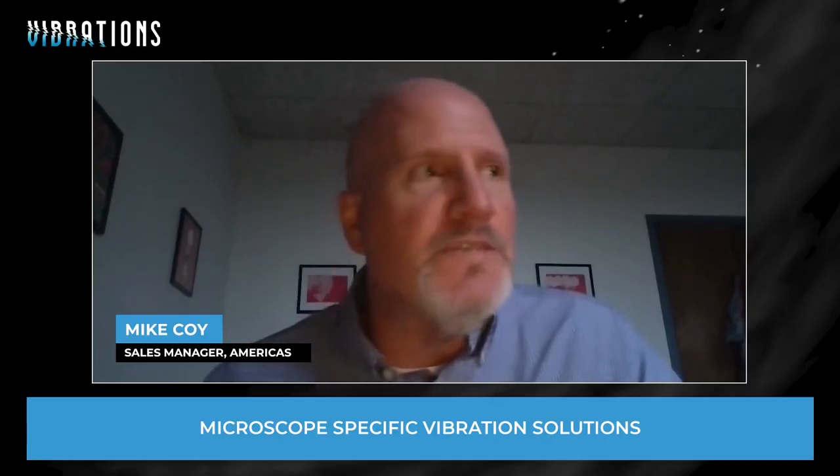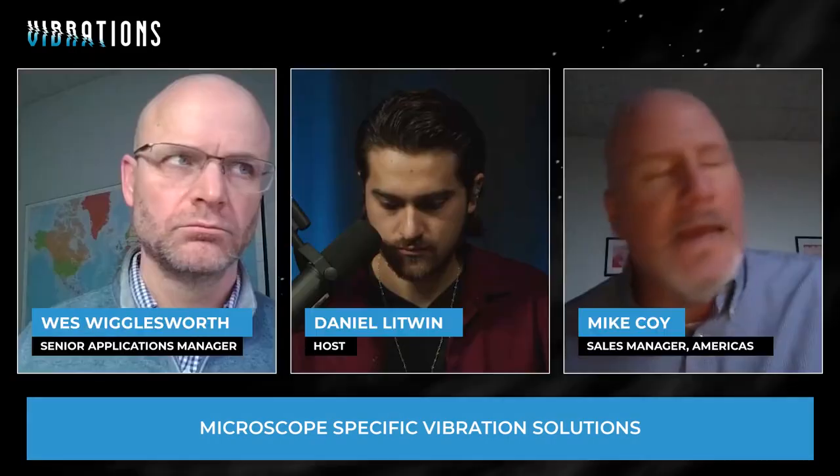And there's a couple quick answers to it. The first one is most people that buy these microscopes, these are not small purchases. They've made very large, significant investments to buy this equipment. And in the process of purchasing this equipment, most of these customers probably took your prized critical sample and went and visited a bunch of manufacturers and had them prove to you the type of performance that microscope is capable of giving you, the type of information that you're going to get back from that instrument when you buy it.